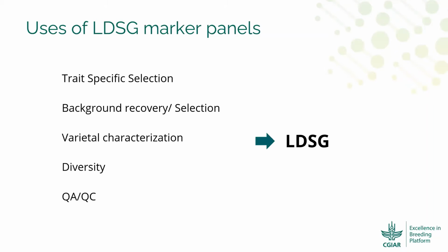High quality data can be leveraged for deployment of GS as well as development of low density markers. Strong consideration for bioinformatic capacity is much required for this HDSG. Next slide, please.